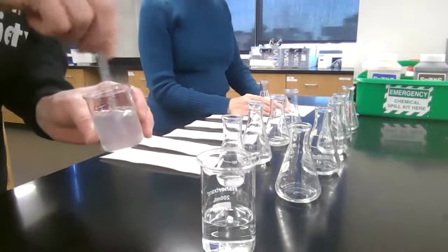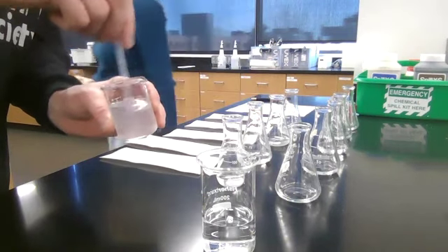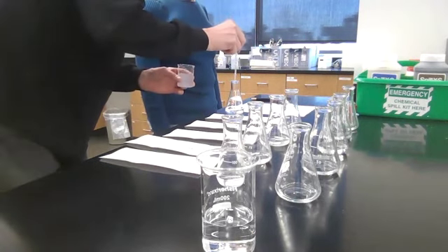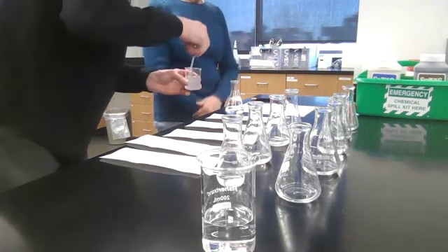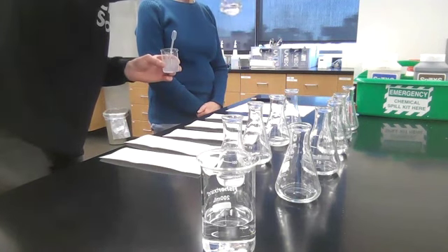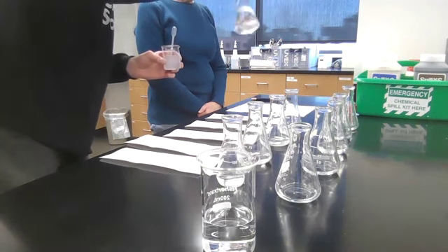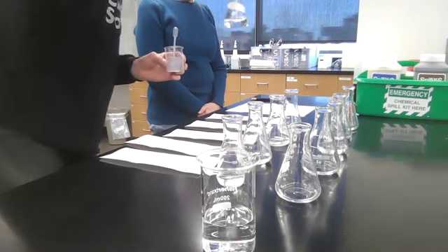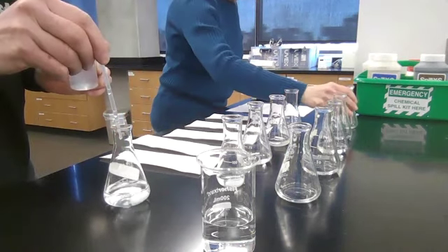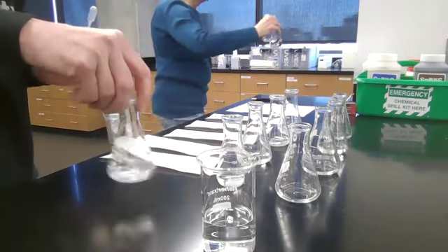Uh-oh, what? I have to remake this one. Hold on, let's put a drop of starch in there. We can demonstrate what color, because the thiosulfate's over there. Oh, no, we don't. Well, it should have reacted, eh? It should have reacted. That's a bad sign.